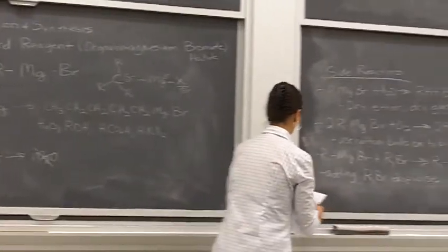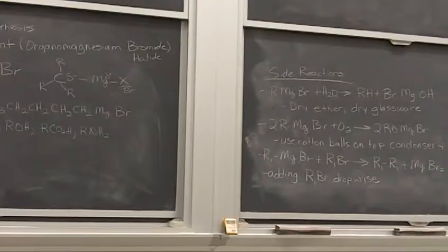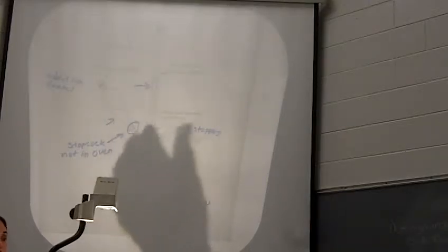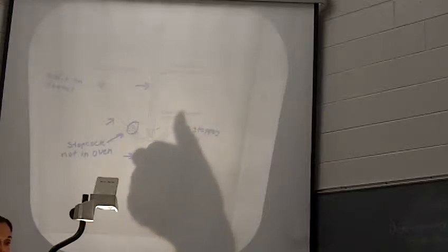So now, well actually one more thing with this guy. At this point, even though you have your stir bar in here, you will not stir your reaction, okay? The reason for that is we don't want to try and kick up and bring in more oxygen and moisture into the reaction. We've got our nice blanket of ether kind of sitting on top of our reaction, and we don't want to bring in any of the things that we're trying to avoid causing side reactions, okay? So there's no stirring here, all right?